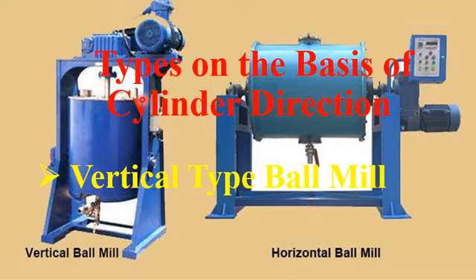Students, please note that through different types of experiments, it is found that the vertical ball mill has the advantage of high grinding efficiency, low energy consumption, and low noise. So the vertical ball mill has an advantage over the horizontal ball mill.